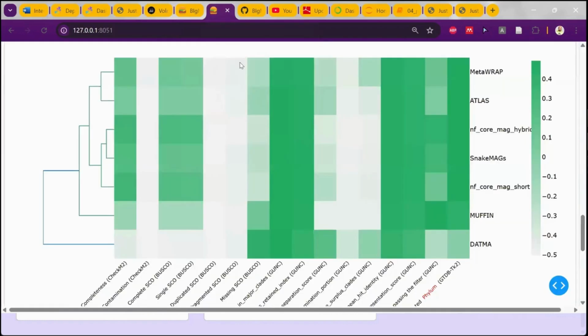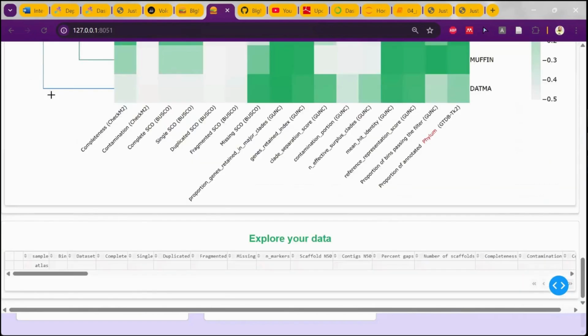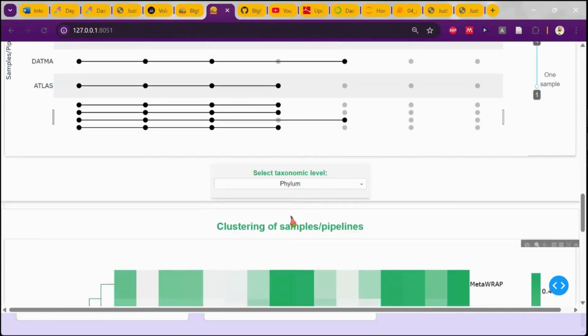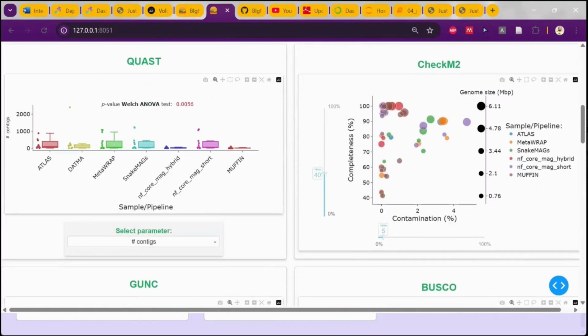Now going back to the application, at the end you can also add the data itself for the user to check. For example, we can add filters or something. I think it needs to be there. So you can explore the data if someone wants to go specifically to a data point that they are really interested in. So now I show you the code.